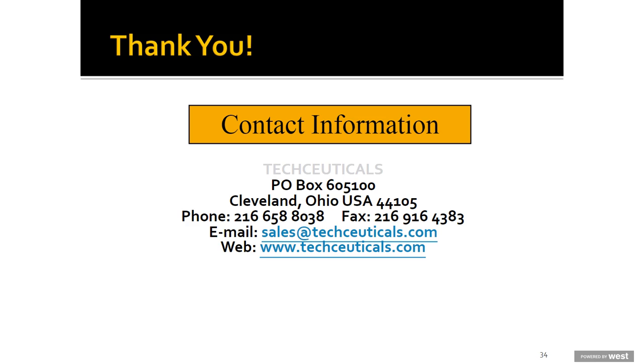Okay. I would like to know the effect of lubrication time on tablet disintegration and how to determine the optimum lubrication time. Wow, that's a loaded question. Karen, did you come up with that one? Yeah, I thought I'd throw you a curveball.